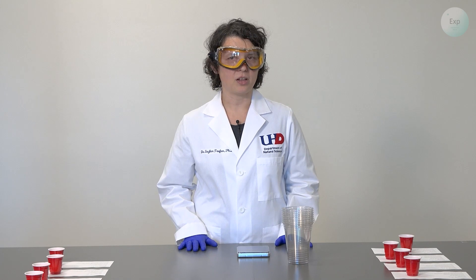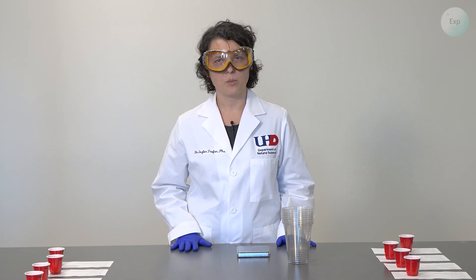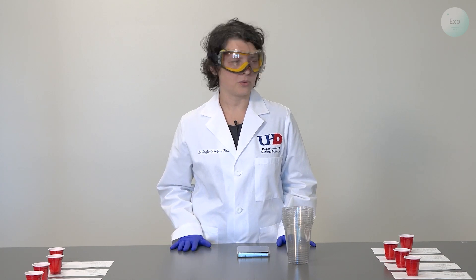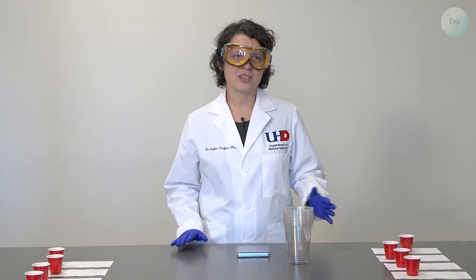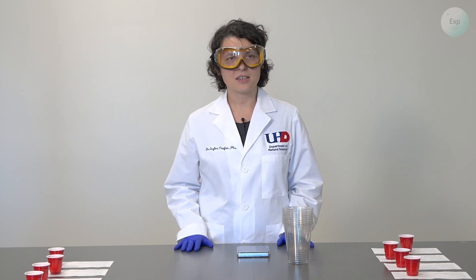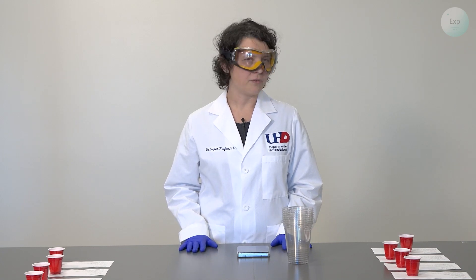We're going to use approximate volumes, but we want to know exactly how much water and vinegar we add to our cups. To avoid having to wash and dry the graduated cylinders, I am going to use two graduated cylinders, both 50 milliliters.